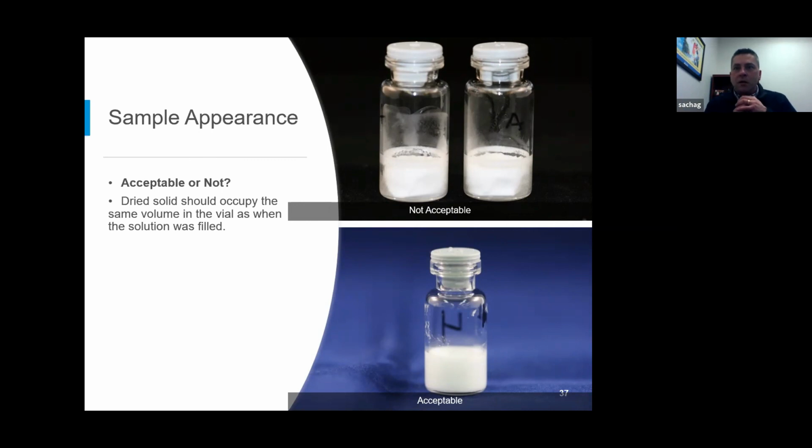It's a good question, because what we become concerned about, let's say if we have to use a surrogate to do these lyophilization studies, is the resistance to mass flow of water vapor from the solid to the condenser. And if your surrogate has a far different molecular weight than your antibody-drug conjugate, it could have less resistance to mass transfer than your antibody-drug conjugate, and therefore dry faster and easier. So those are some things to keep in mind.